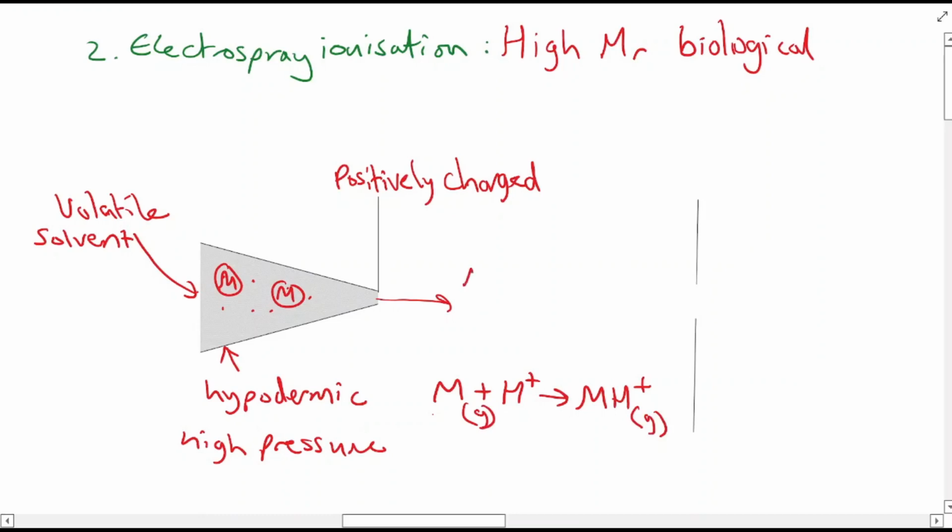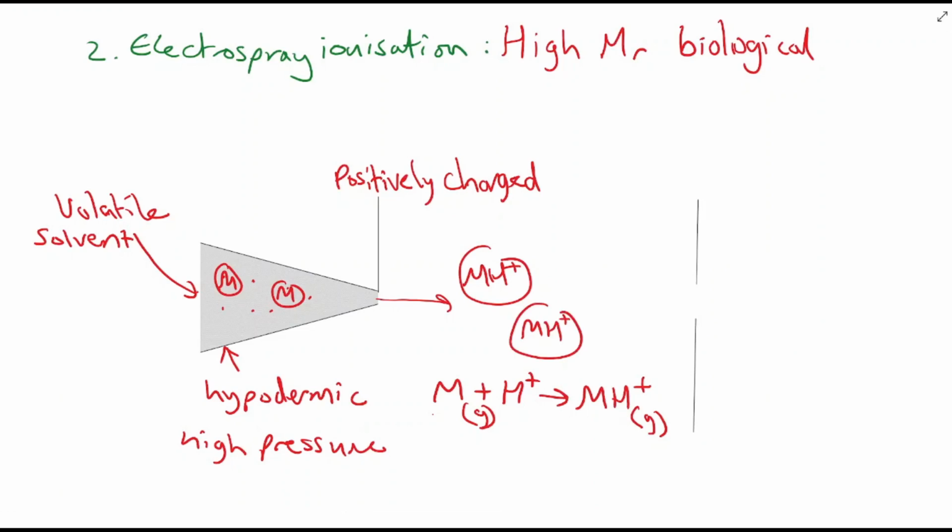So in this area here, I've got MH+, MH+, and then this is my acceleration panel here.